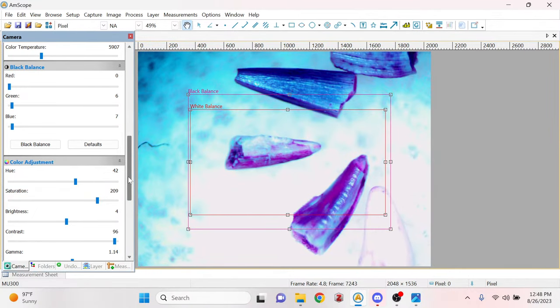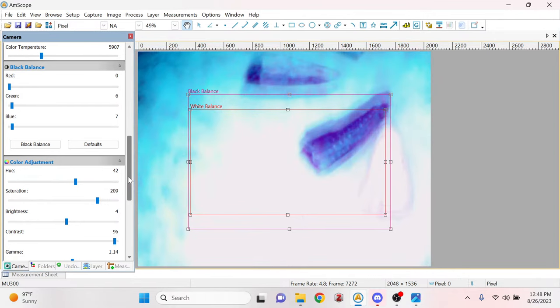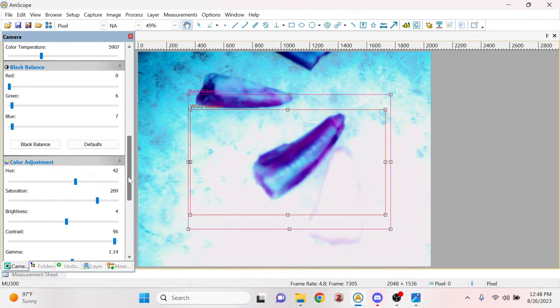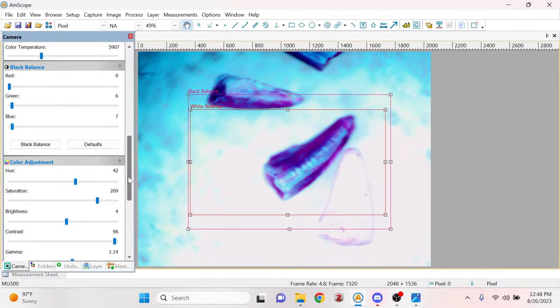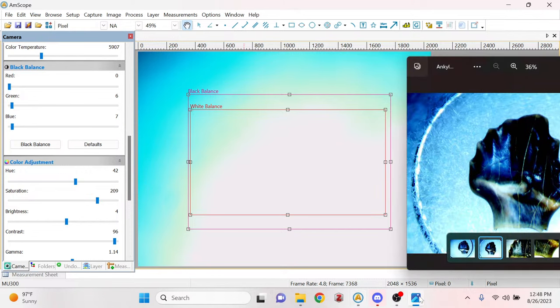Microstream is definitely part of my year two plan for what to do with this project. And while I'm just focusing on photography today, I might put these teeth away for now, just so we can look at some other stuff. I've got so many things that I can go through. But in future, I'm going to try to do the same thing I did for my job, which is sort microfossils under the microscope. Let's see, what do we got here?